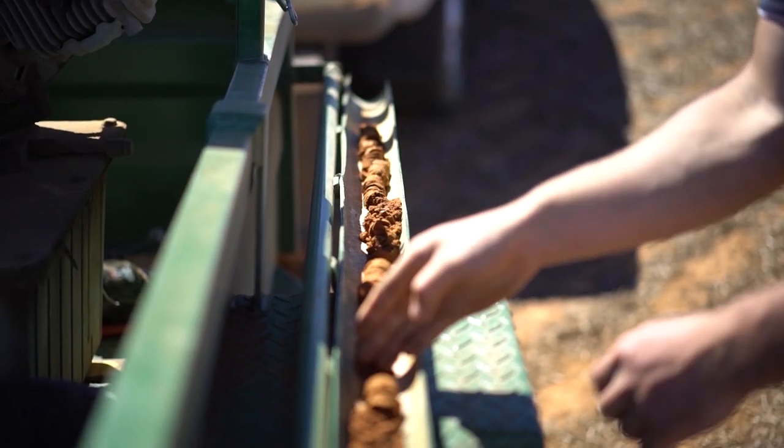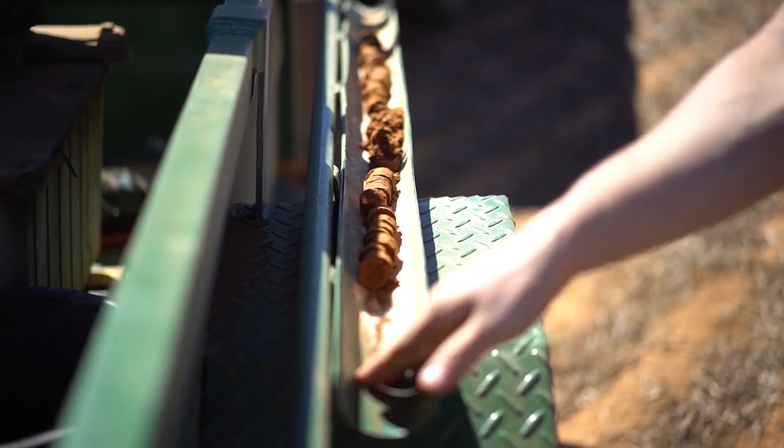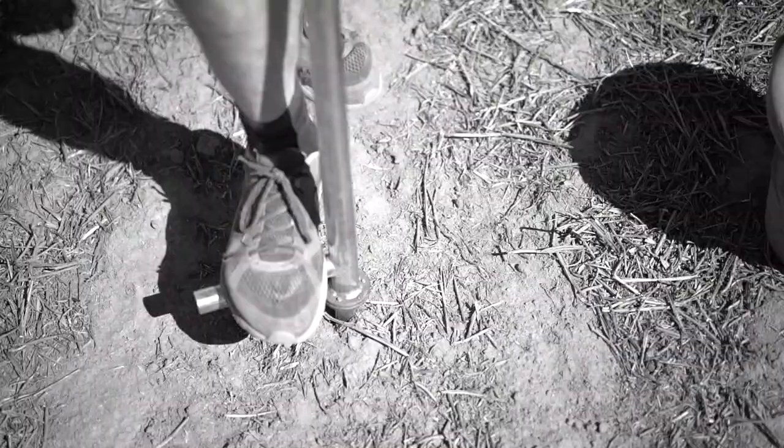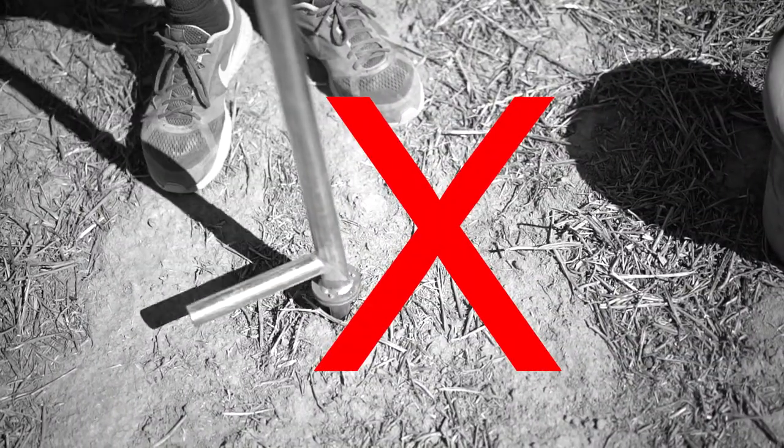We're getting rid of the 0 to 10 in the deep core. From there, we're taking six shallow cores of 0 to 10 around each deep core. The only really important thing to remember is making sure we get 0 to 10 and accurate depth control.